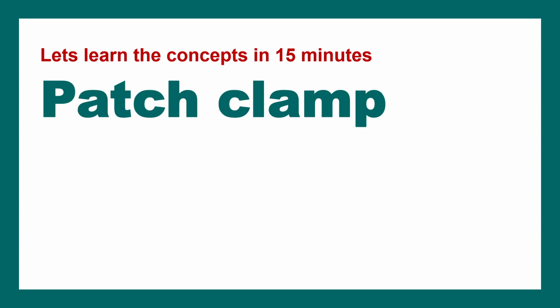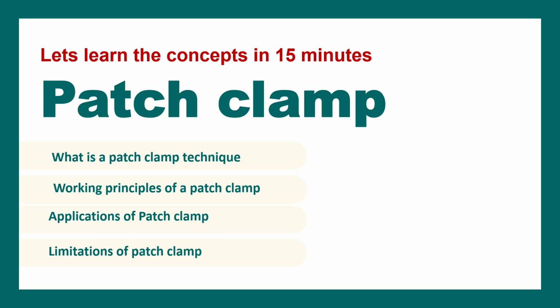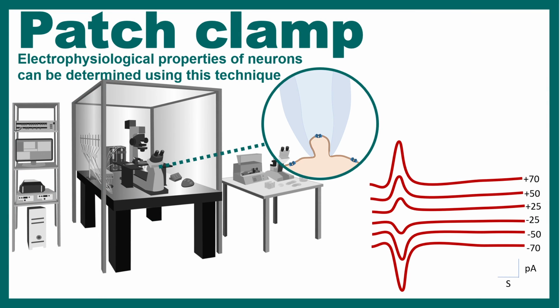So let's learn the concept in 15 minutes. We'll learn what patch clamp is, the working principle of patch clamp, applications of patch clamp, and limitations of this technique. Patch clamp is an electrophysiological technique which allows us to understand the physical properties of the neuron.